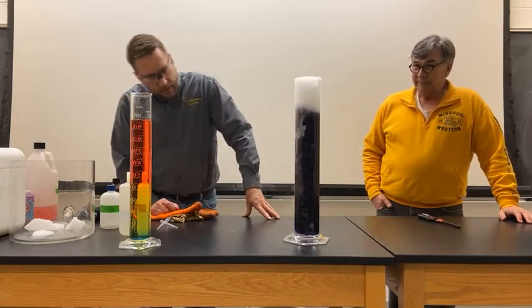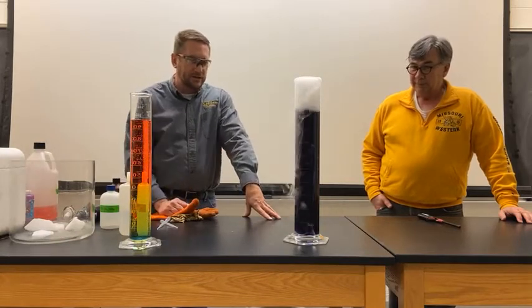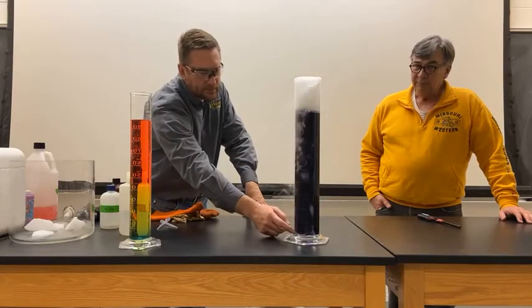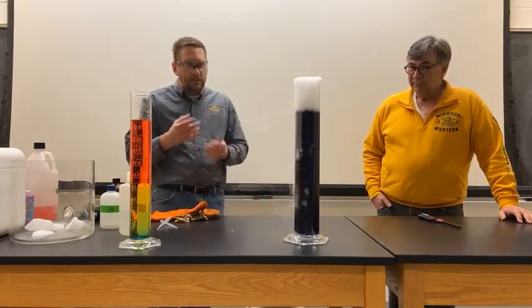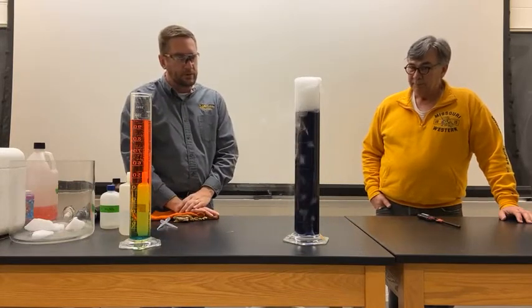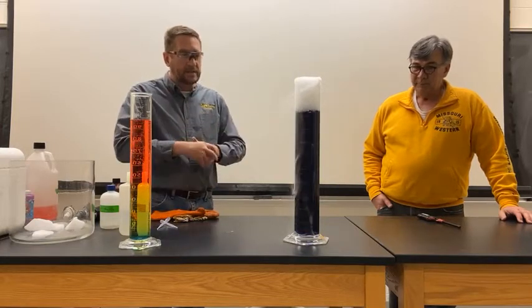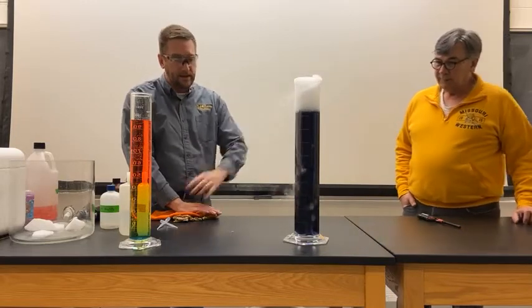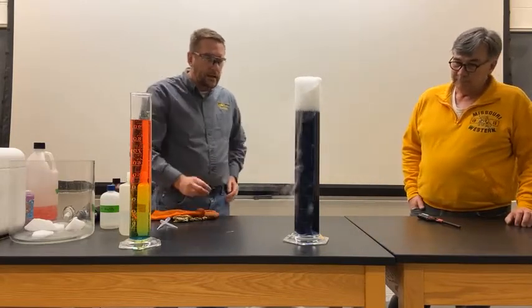Okay, so I know that it doesn't seem like much has changed here, but actually we are starting to see the change. I can see the purple color is now beginning to be a little bit lighter. And what happens when that carbon dioxide dissolves into the water is we form something called carbonic acid. And that carbonic acid is going to neutralize some of the sodium hydroxide. In fact, over time here, it's going to neutralize all of the sodium hydroxide.